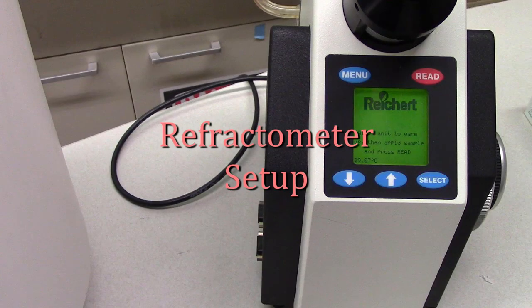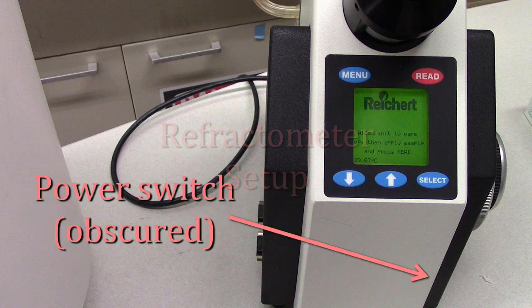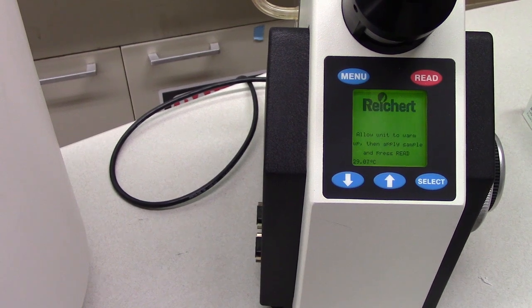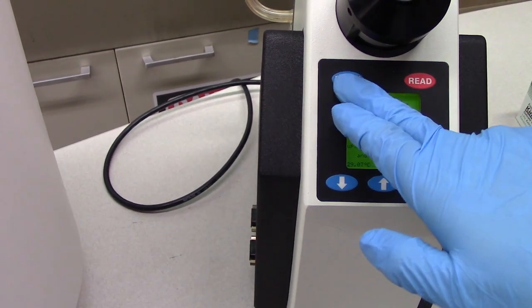Begin the startup by turning the refractometer on. Toggle the switch located on the right side of the unit. Next, check if the refractometer is configured correctly by pressing the Menu button.